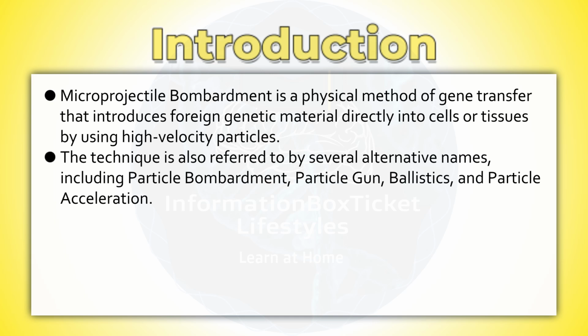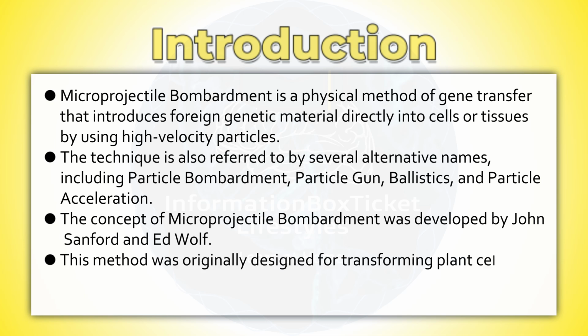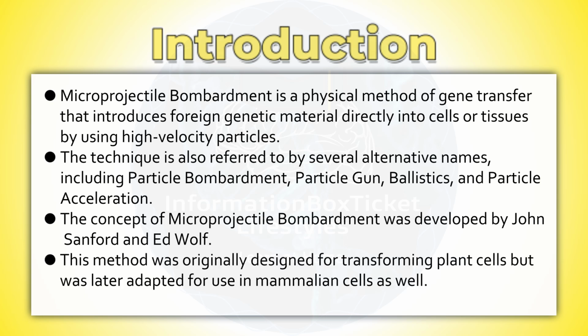The technique is also referred to by several alternative names, including particle bombardment, particle gun, ballistics, and particle acceleration. The concept of microprojectile bombardment was developed by John Sanford and Ed Wolf. This method was originally designed for transforming plant cells, but was later adapted for use in mammalian cells as well.